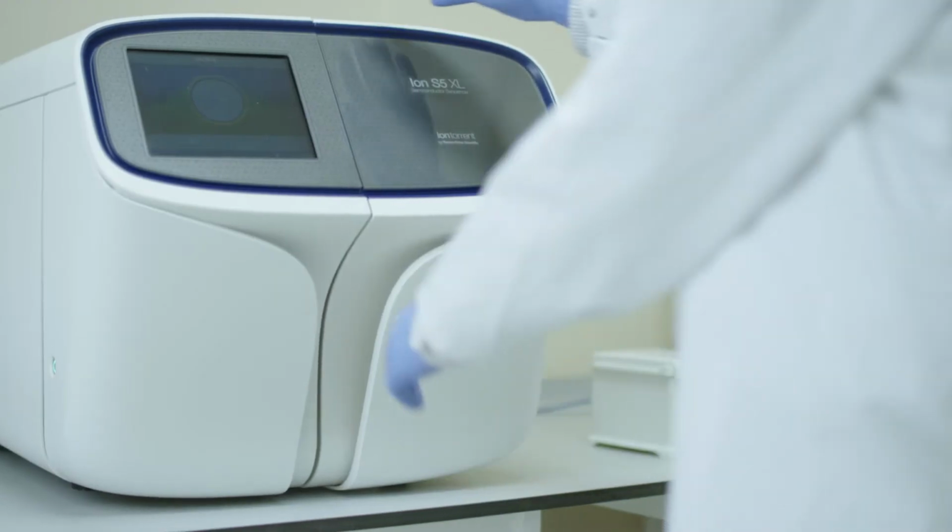We're quite agnostic about what technologies we use. We generally take the approach of using the correct technology for the correct sample. So we have looked at both array-based technologies, we've used NGS, we've used targeted NGS, we've used qPCR, and we've even used QuantiGene.